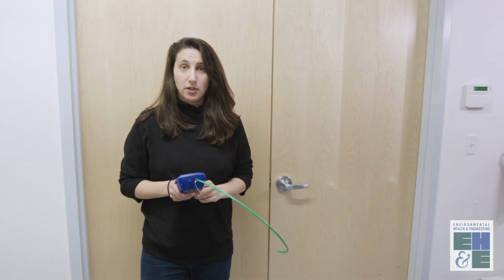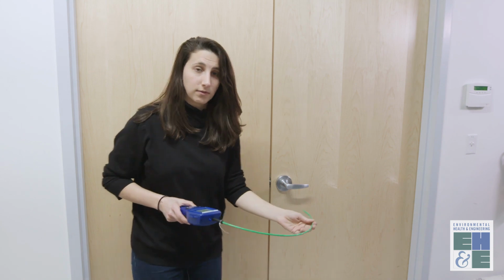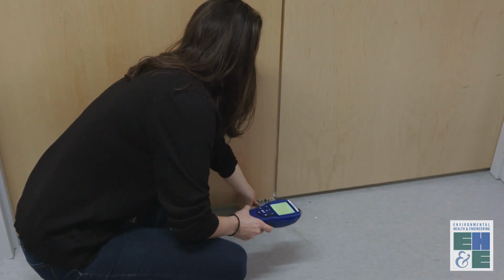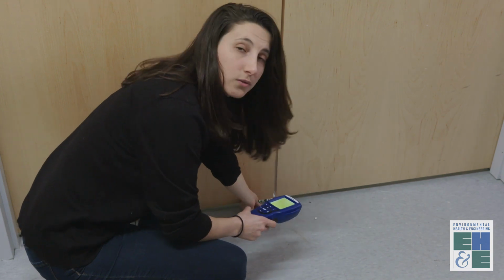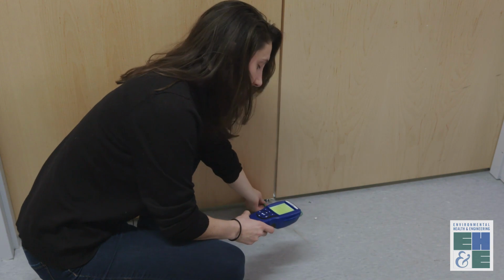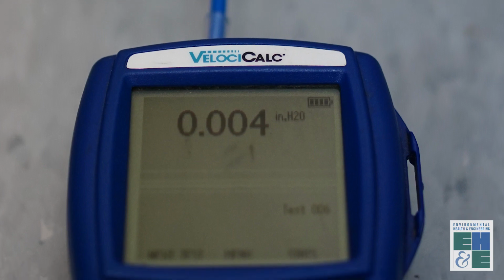So when you go to take the measurement with the instrument, you would take the tubing and put it under the door. And if the room is negatively pressurized in comparison to the corridor where I'm standing, the number on the screen will be negative, and if it's positively pressurized, then it will be positive.